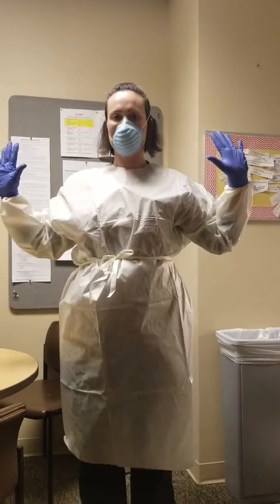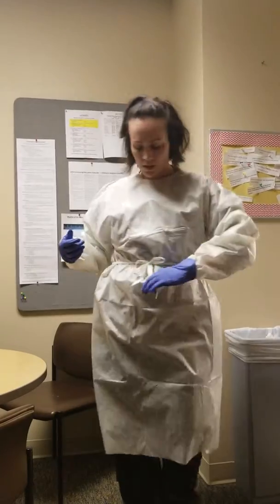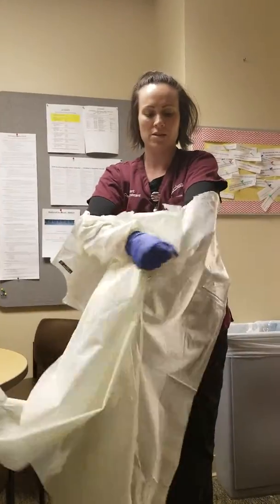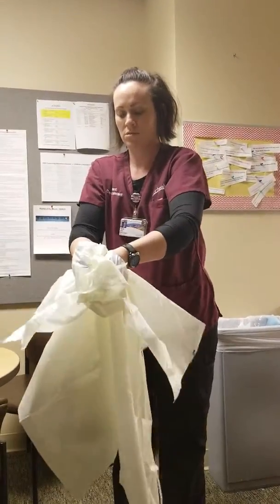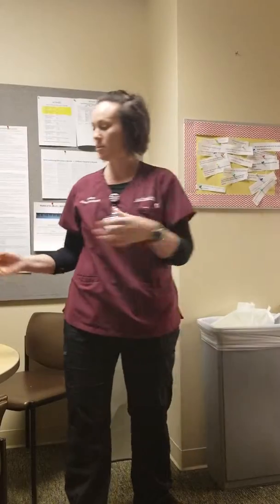Alright, now I'm going to go ahead and take it off. First thing I'm going to do is take off my mask — put it in the trash. Take my gown off. I'll do my gloves with it, rolling it away from me. And wash my hands.